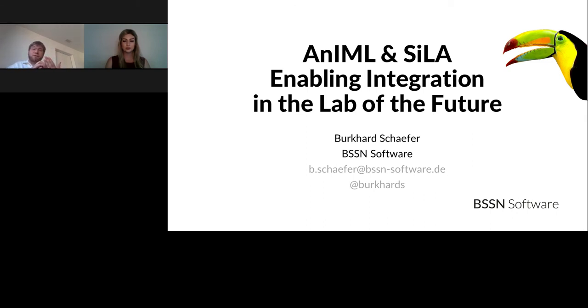And in a number of jurisdictions, that digital signature mechanism that AnIML uses is actually equal to a handwritten signature. And that gives you a very nice way of achieving compliance by demonstrating your chain of custody of the data and building a nice data integrity story.